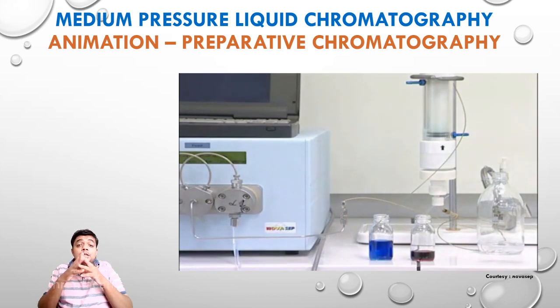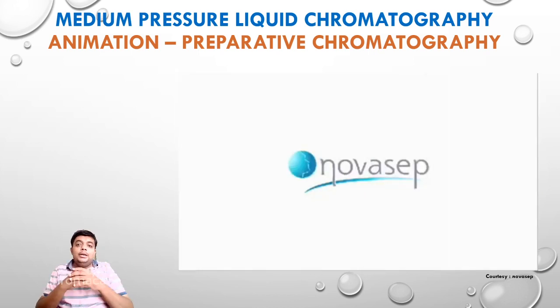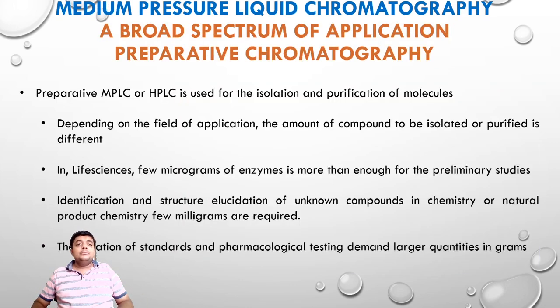You always will have a requirement of preparative chromatography, and this is a basic principle in an animated video form to make the concept clear to you. We are equally thankful to NovaSep for providing us such videos on Google. Now, let us move ahead.